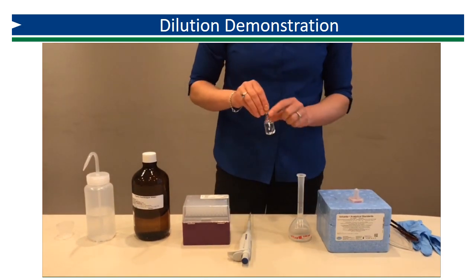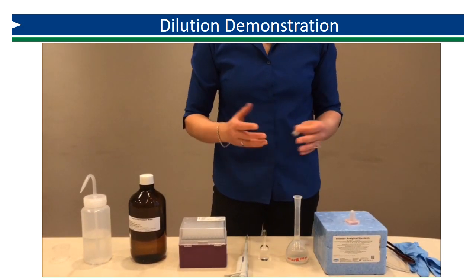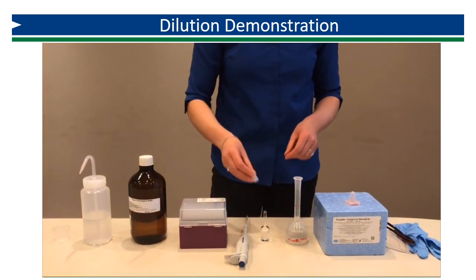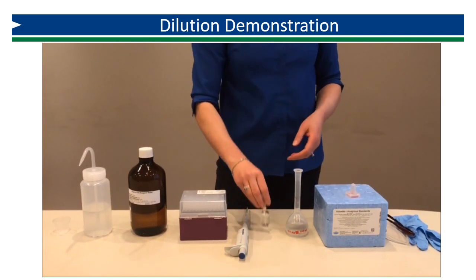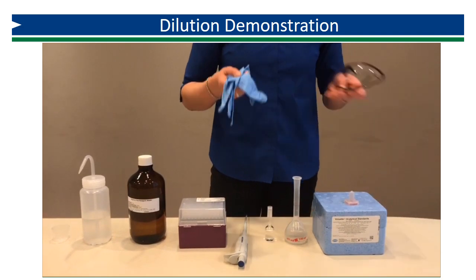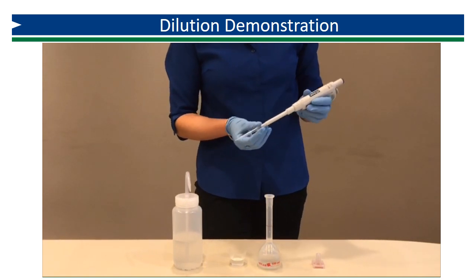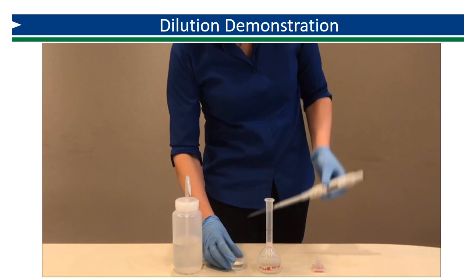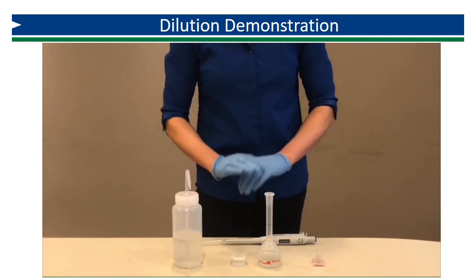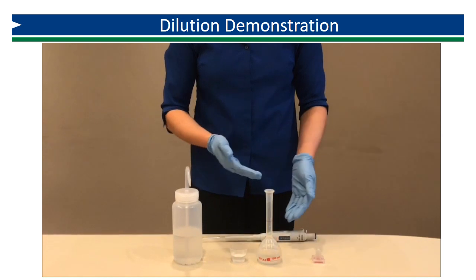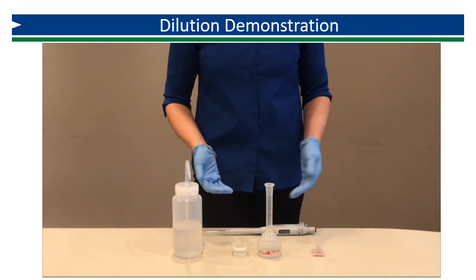In order to break open the glass vial, you want to use either a plastic breaker — which you can buy — or wrap it in a paper towel to protect your hands. You don't want to break it barehanded as you could cut yourself on the rough glass. Before opening, make sure you have on your gloves and safety goggles. Since I'm not able to fit the pipette tip into the actual vial, I empty my standard into one of these inert, chlorine-demand-free medicine cups. Another good option would be a glass beaker.